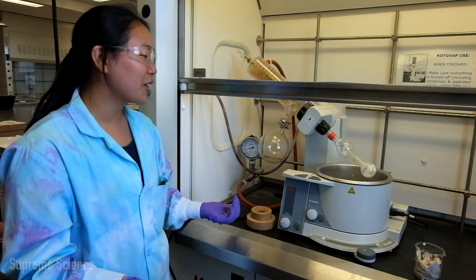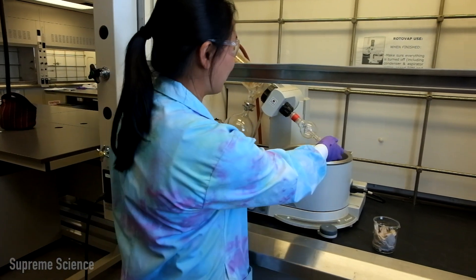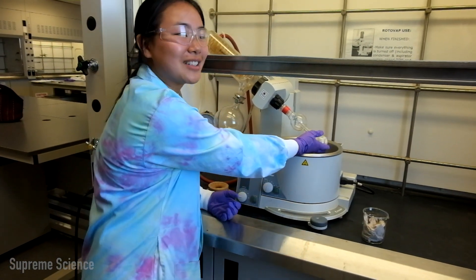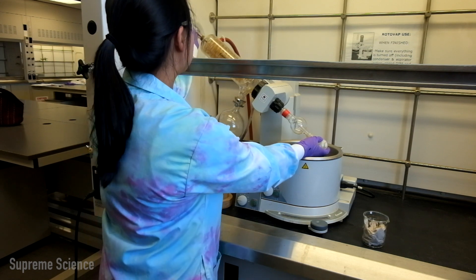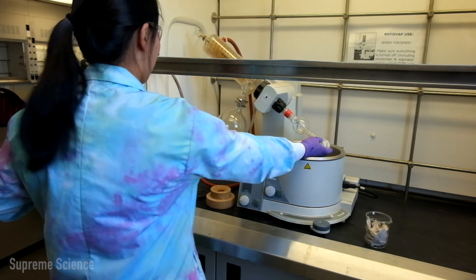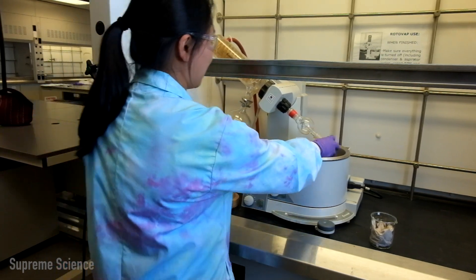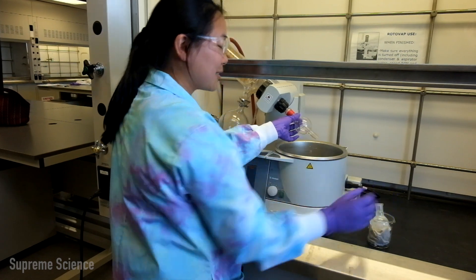So now that we have our product, we can remove the round bottom flask from the rotovap. So you want to hold this because you don't want it to fall. And release the stopcock and shut your vacuum off. And you can remove your round bottom flask and put it in a beaker.